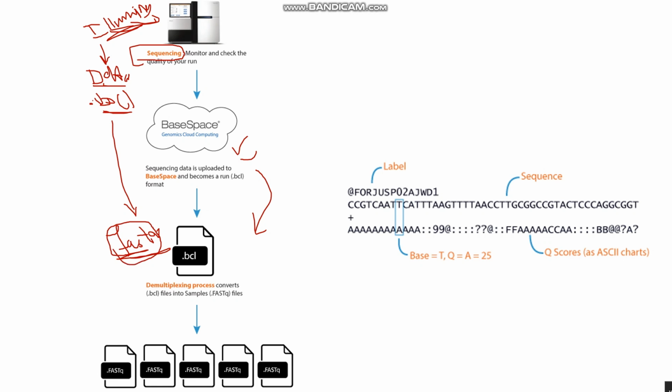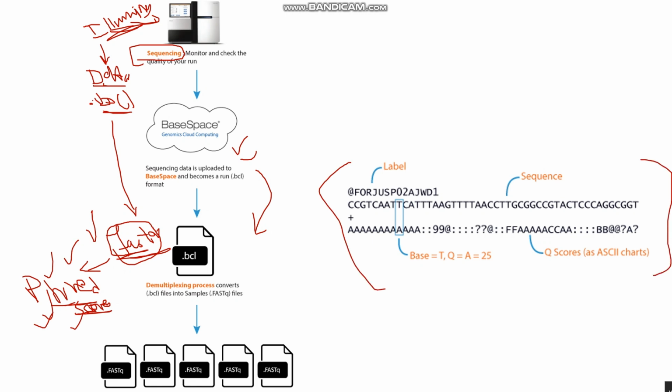Why into a FASTQ file? Because by the FASTQ file we get the Phred score. As it's a FASTQ format, in which there is a Q score, that is the quality score or the Phred score.